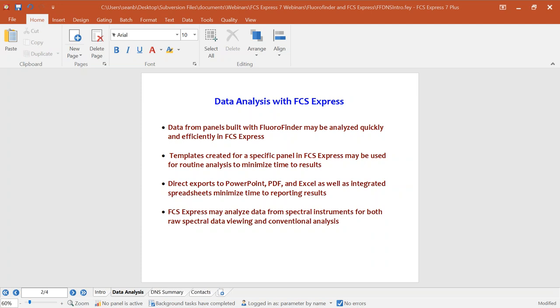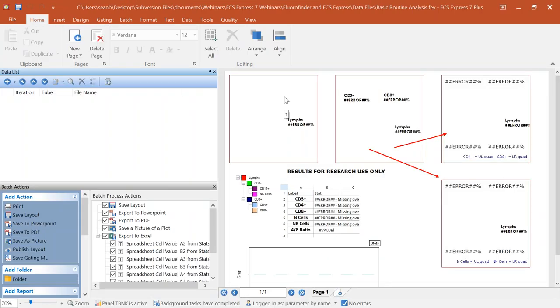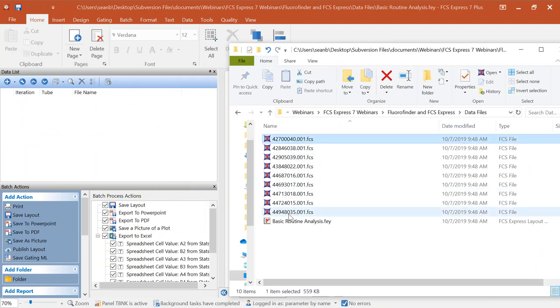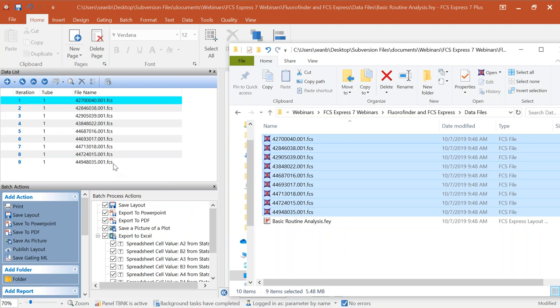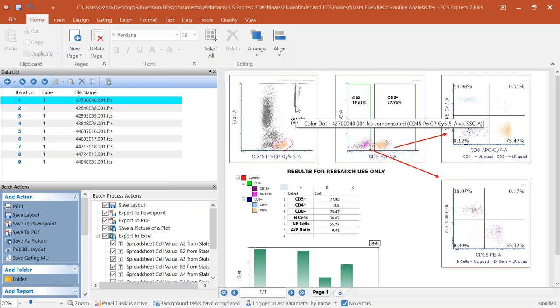To get started, I like to start at the end and show you what this can look like. What we have open right now is an FCS Express analysis template. To populate it with data, we have something called the data list. You can pull data into FCS Express simply by grabbing FCS files and dragging and dropping them into the data list. Behind the scenes, all of our analysis and charts automatically populate with the data pulled into the data list.